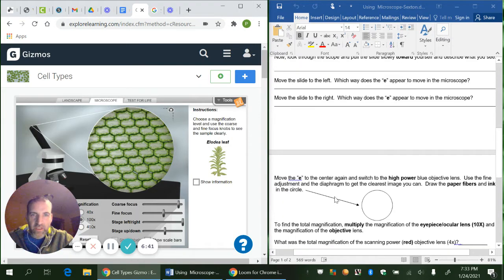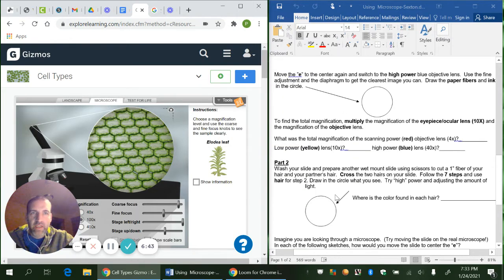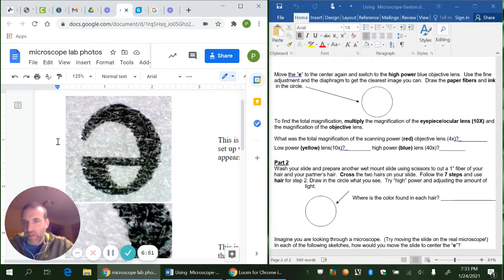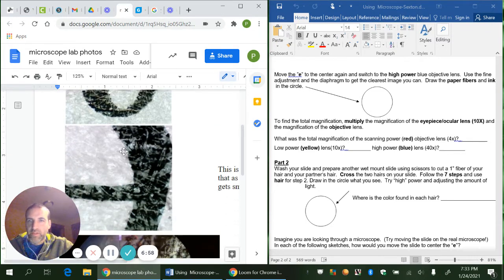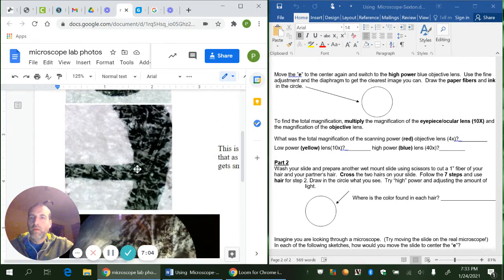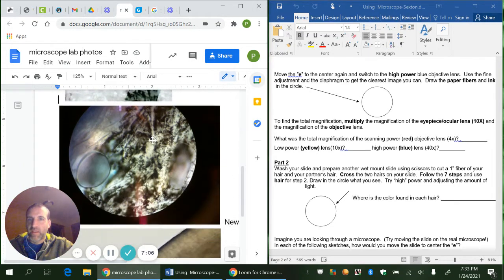Next, we're going to move on to the next question. And we're going to go back to that newspaper E, and we're going to look at it under high power. And so I've got another photo. This document, by the way, that the photos are in is in Schoology for you to look at on your own if you want to. And so this second photo would be under low power. The first one is called the scanning power lens. Then we've got low power. And then this photograph is one that would have been taken under the highest power.